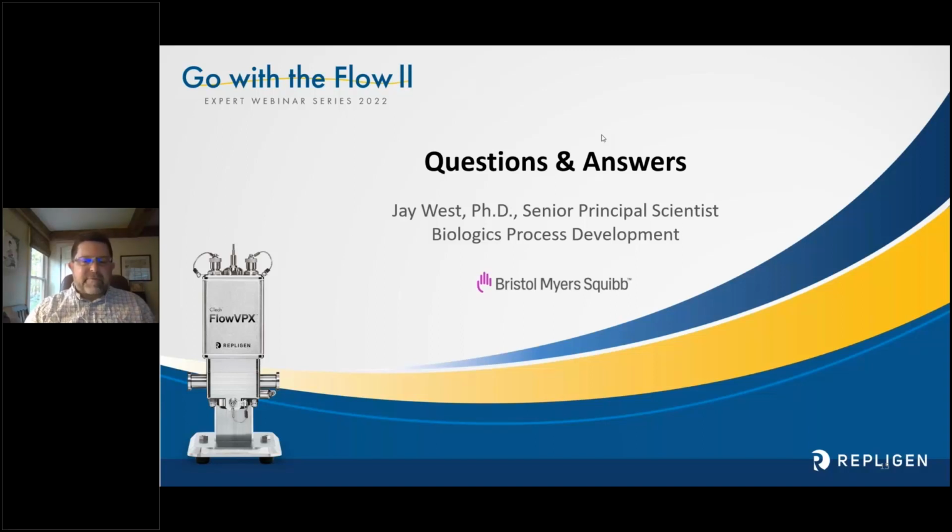Another thing to emphasize is that it really makes the process more efficient if you can hit the UF2 set point very precisely, because then you don't have to do further dilution to get to your pre-formulation target zone, which is what's called the purified drug substance. You can literally stop your process, flush it, recover it, take one more sample. You'll find out it's in the correct concentration, because there is a bit of a buffer flush, so it does get diluted by having been recovered, and then you find out, right on target. You add your excipients and then go, and that's it.